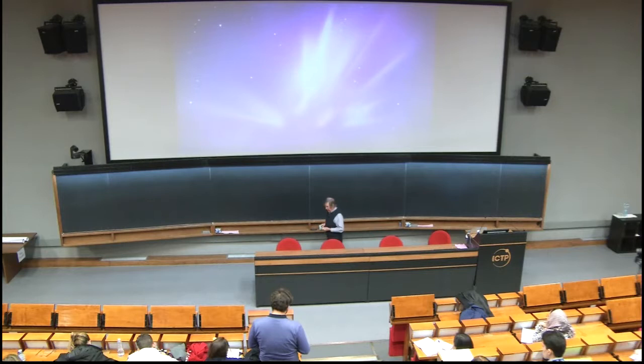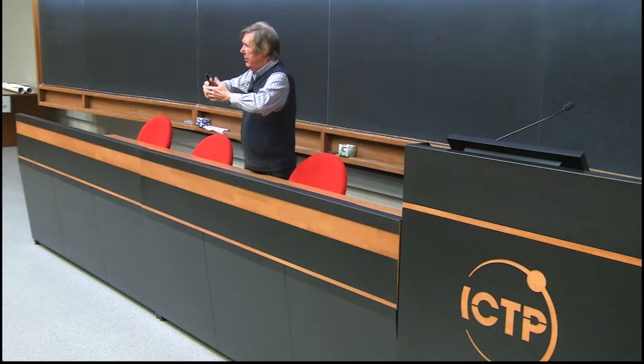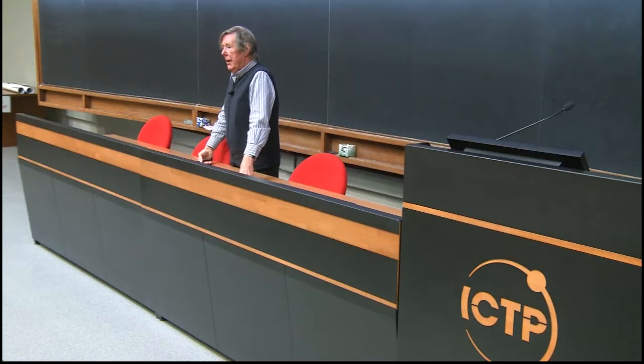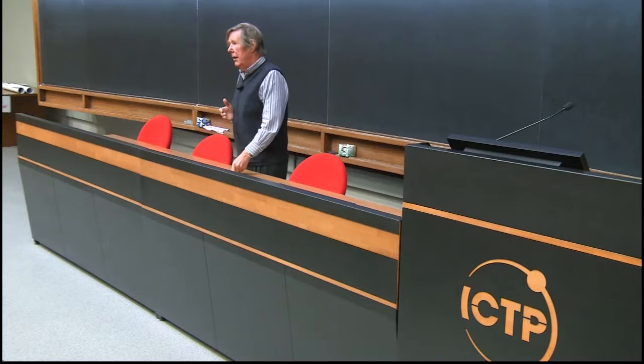Basically, when you're doing structured illumination, the structuring is done by a lens, right? Sure. Which has got a fixed aperture, and you can't beat a complete hemisphere or whatever with a lens. So the trick in ptychography is they take signals in the Fourier plane and then they do phase retrieval on it.